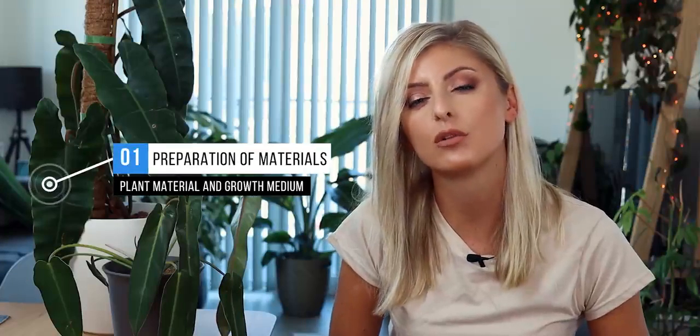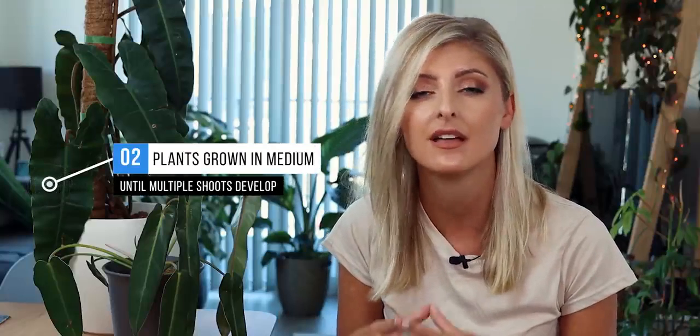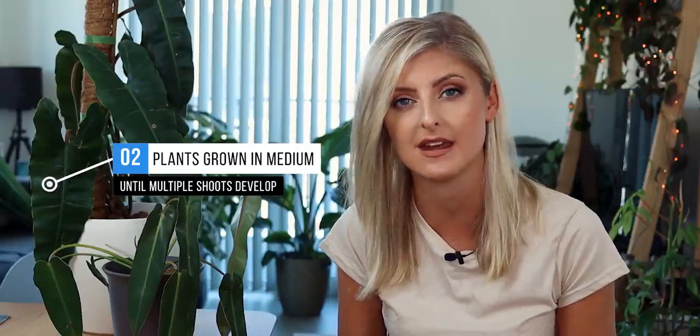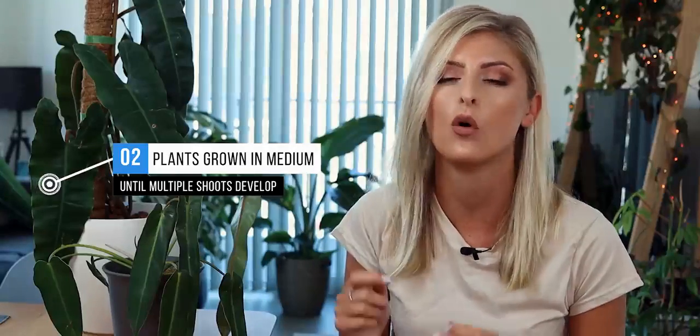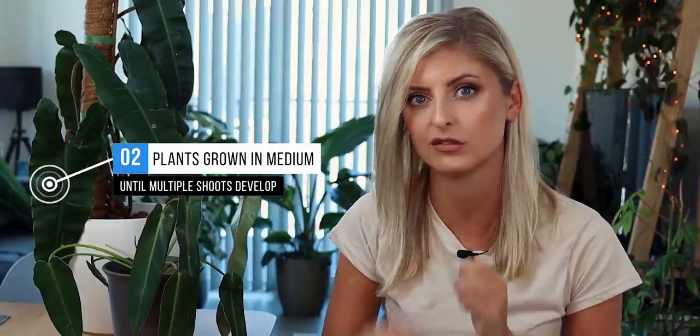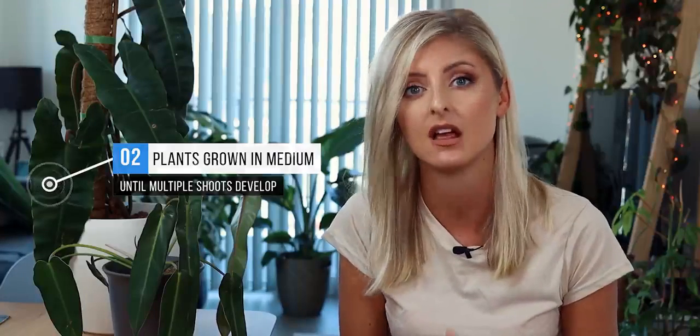So, okay, how do you actually tissue culture a plant? What do you actually do? What are the steps? What generally happens is the growth material is prepared along with the plant material that is going to be used. The plant material is then placed into the growing medium, and over time, the plant will multiply within the medium. So if you have a node on a Monstera that you're shoving in there, over time, this plant is going to start sprouting multiple shoots from this original plant material.